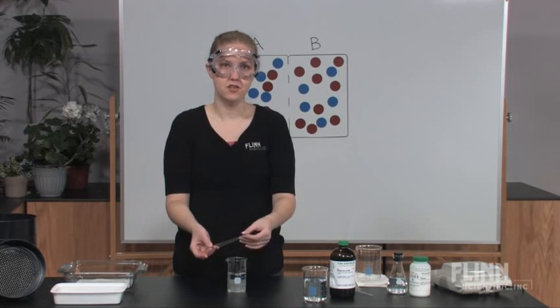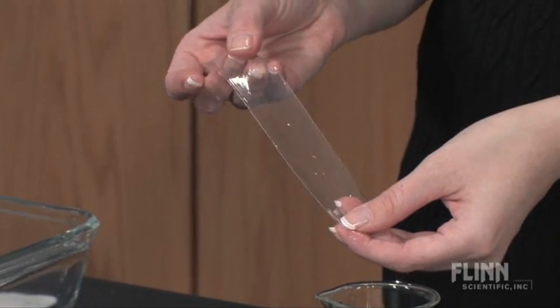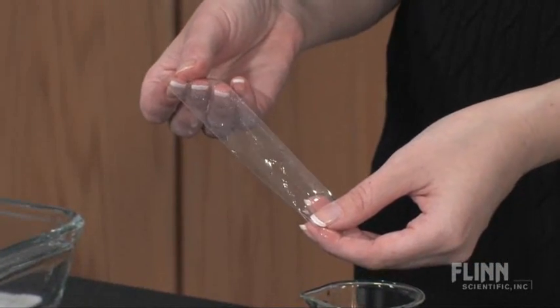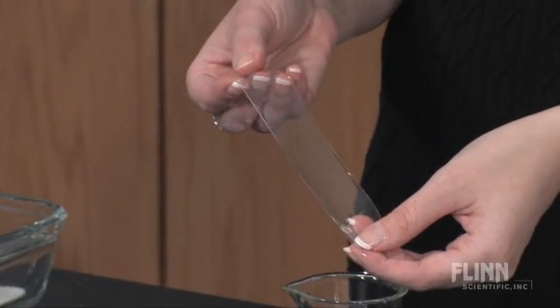Dialysis tubing is made of cellulose perforated with microscopic pores. The pores are small enough that it can be used to model the behavior of a cell membrane with respect to the size of the molecules that will or will not diffuse through them.